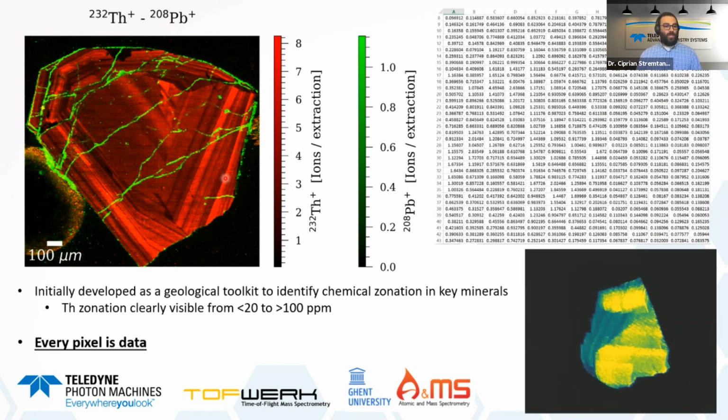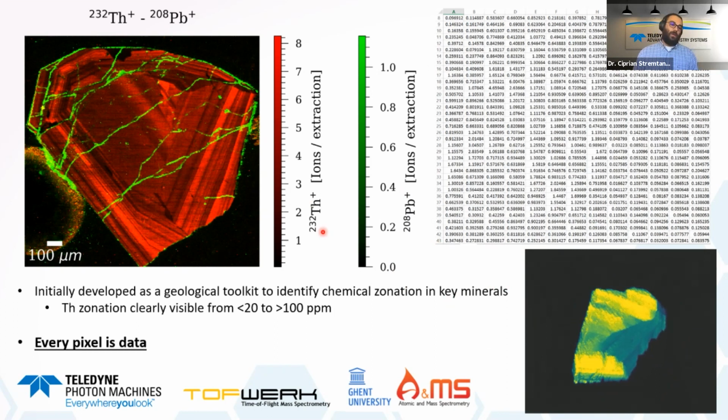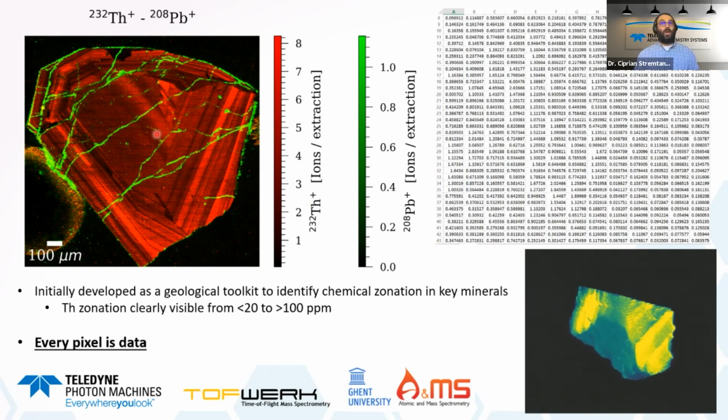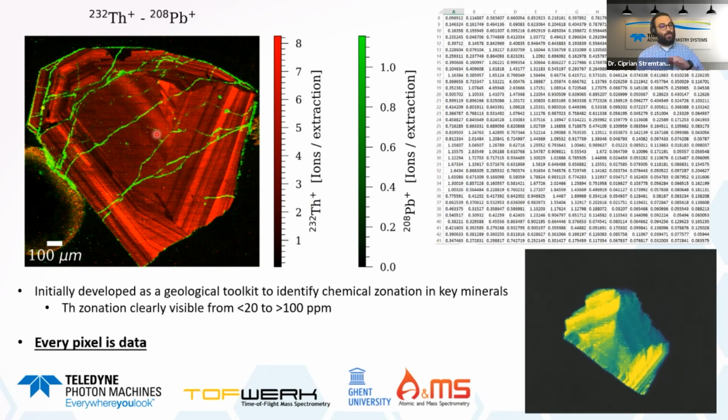An important thing to keep in mind, and that's shown here on the lower right-hand side with the looping video, is that those zonations, or those chemical variations, are a 3D feature.